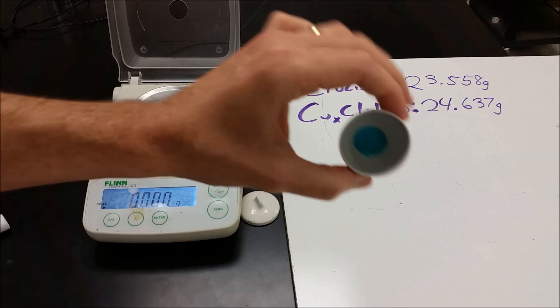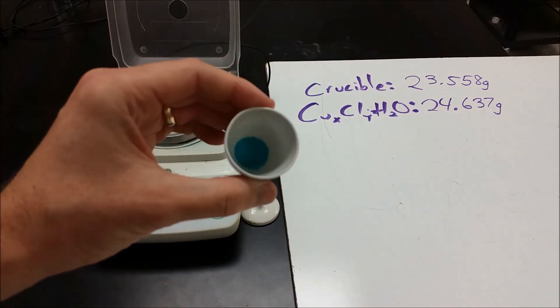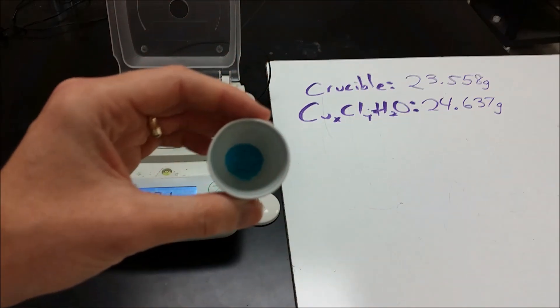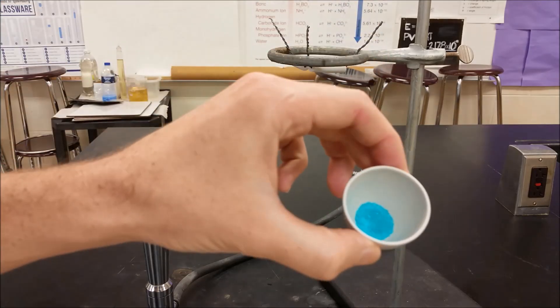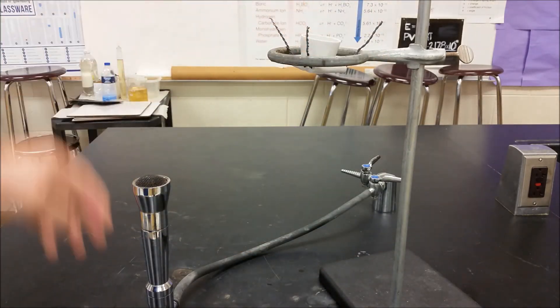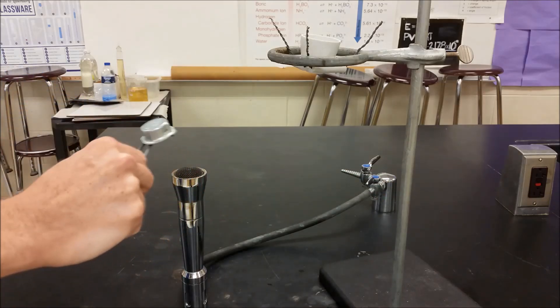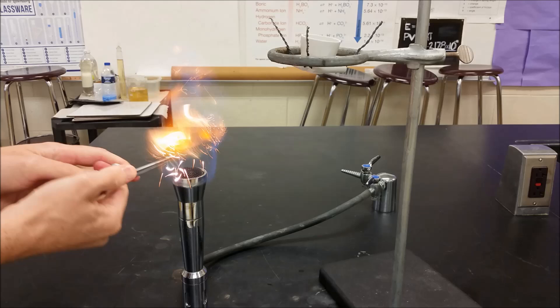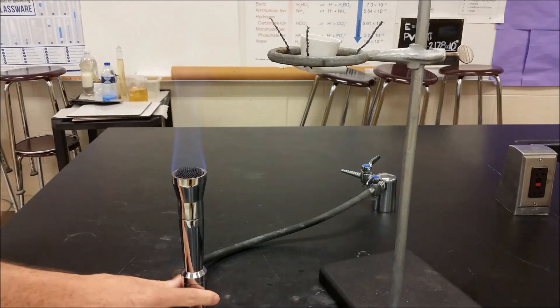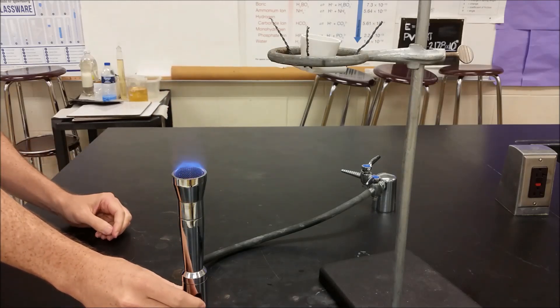So now we're going to take that and we're going to heat that until it changes color, from that blue-green until it's completely brown. So we have our hydrate here, and we're now going to heat it. We're going to light our Bunsen burner. Make sure we have a nice, good blue flame.